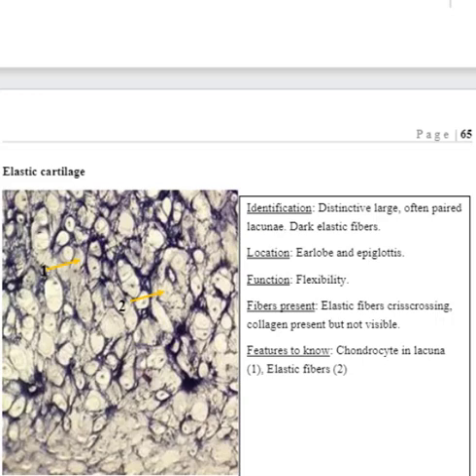So kids ask me, what am I supposed to study when I read this chapter? Well, here's a nice little summary. Elastic cartilage is found in the earlobe and epiglottis. So when you ask that on the test, you'll see the slide and it'll say, what is this? And where would I find it? Or what is this? And what is its function? So if you cannot recognize this tissue, then you're not going to know what its function is either.